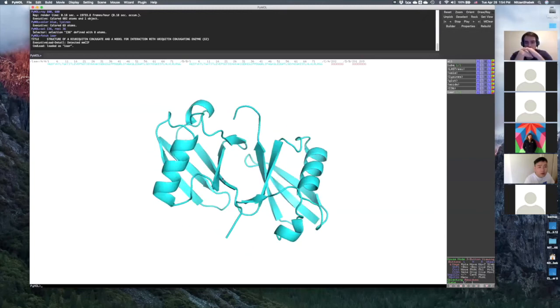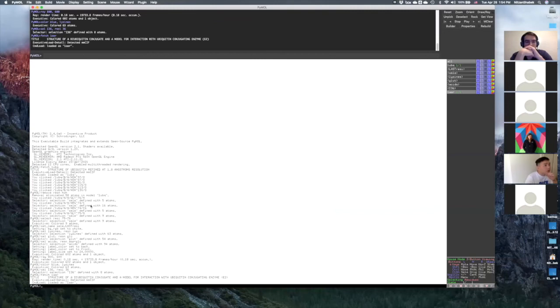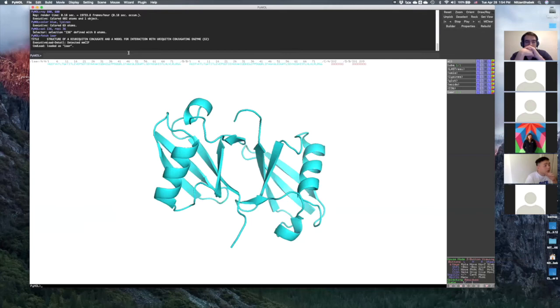So how is that going to happen here, and what do we see here? So first, I want us to identify where is the lysine 48 that gets ubiquitinated. So let's select and try to identify the lysine 48. Try to do it if you remember how we did it before. If you don't remember, you can press escape and try to see what we've done before here. Try to select lysine 48, and you can do it with whatever method that you want to do. And let me know when you're ready.